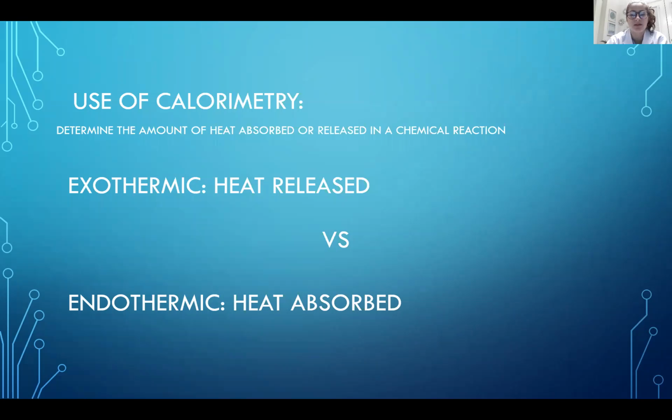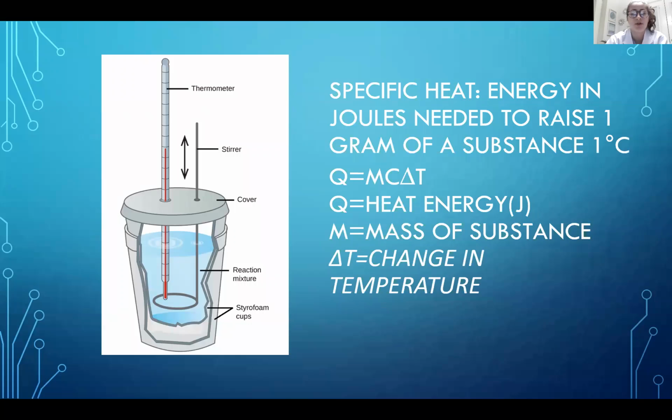When discussing surroundings and systems, it is important to note that the system refers to the chemical reaction and the surroundings relates to the outside factors such as solutions, air, etc. Calorimetry works because by using a substance that is well known, such as water, as the surroundings, it is possible to discover the transfer of energy that took place in a reaction.